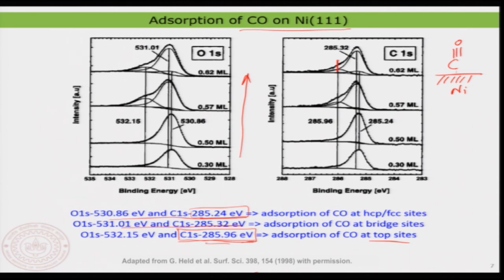But now what I want to say again is that here also you see a strong influence of the coverage, and as the coverage increases, the molecules are trying to occupy the top sites and the bridge sites, and at lower coverage all the molecules are occupying only the HCP and the FCC sites. So these are the sites that are much more favorable for adsorption in general. But this is also something we have discussed when we were looking at the energetics of the adsorption.